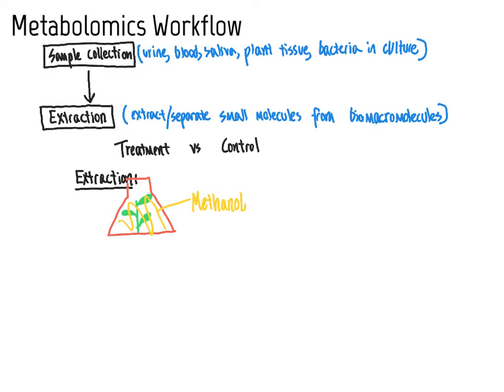And so ultimately, the compounds present within the plant will be introduced into that methanol solvent. The methanol is helping lyse open the plant cells and solubilize the organic metabolites, the small molecules, in that organic solvent.